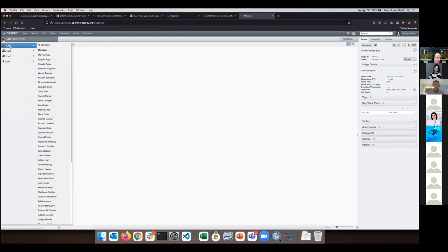So we are in a group. The Omero users are organized in groups. You can be a member of one or more groups, and the groups have a very important aspect that they are enabling cooperation. So you can see or not the images and your peers in your group. It depends on the permission levels on that group. So we have permissions: private, read only, read annotate, and read write, and it does what it says on the tin.